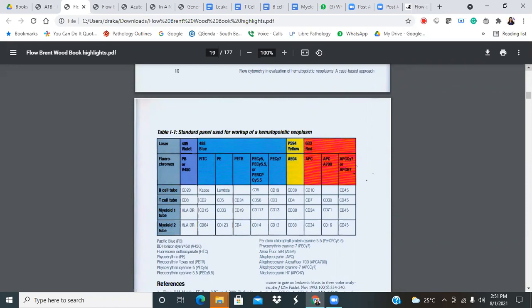I think it can be played around, but Rajeshwari will have a better idea than me because she went into the lab and especially saw all of those things. So the thing is, some of these fluorochromes are brighter and some are dimmer naturally, and also the nanometer at which their natural fluorescence occurs changes their behavior. So we see that the antigen that is most expressed on a cell will have a dimmer fluorochrome, and the antigen that is least expressed on the cell will have a brighter fluorochrome.